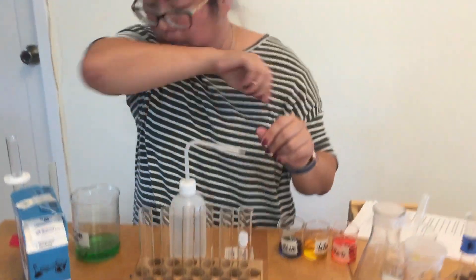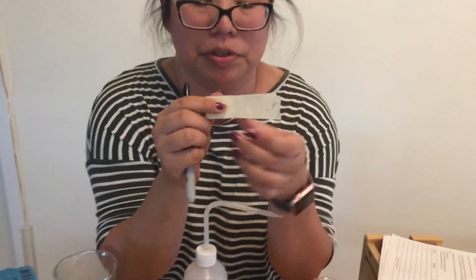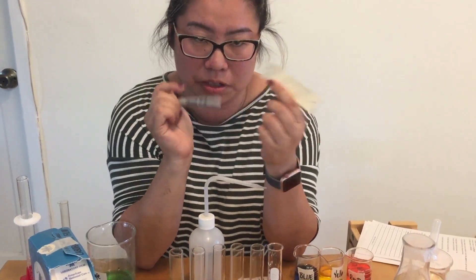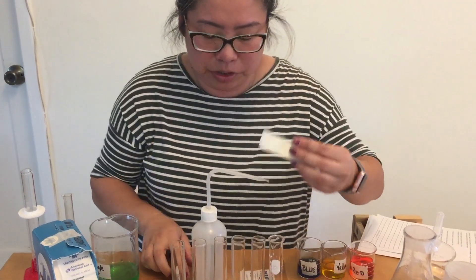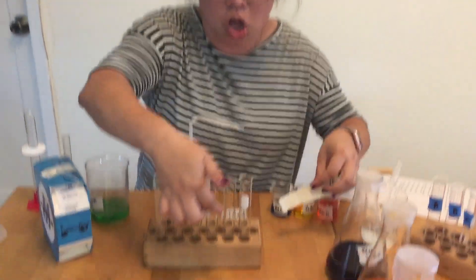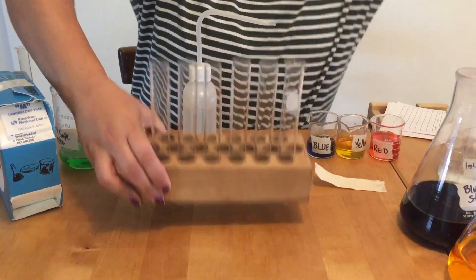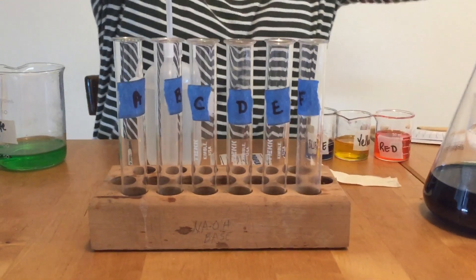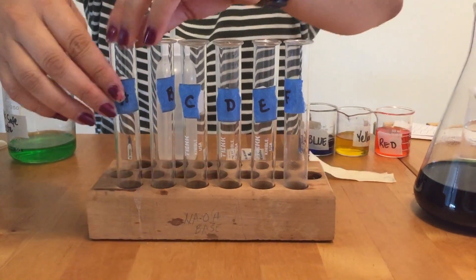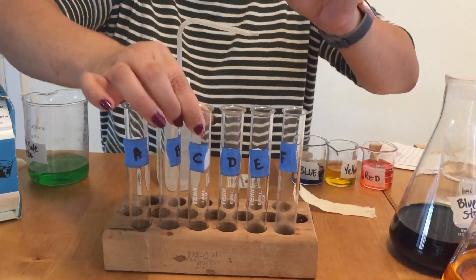Step two: you're going to take the permanent marker and labeling tape. Each group will get a different color of tape. You're going to label the test tubes A, B, C, D, E, and F — one label for each test tube in order. Some test tubes may already have something written on them; we're going to ignore that and put a label over it.